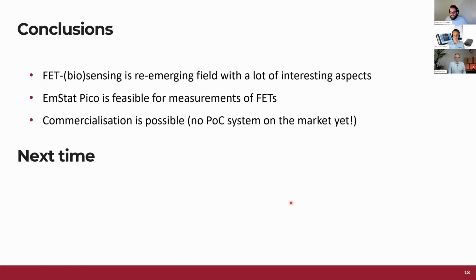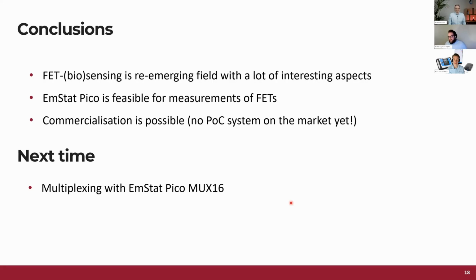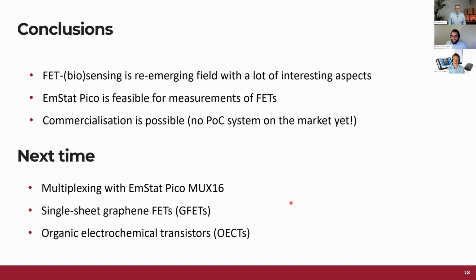And for the next time, so again, same date, same time, same place, we'll talk more about multiplexing with EmStat Pico. We'll talk more about single sheet graphene field effect transistors, which are the core of my scientific work. And also I had some side project with organic electrochemical transistors, and we'll cover that as well.